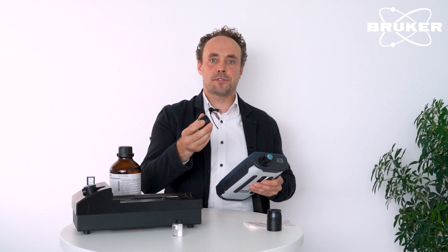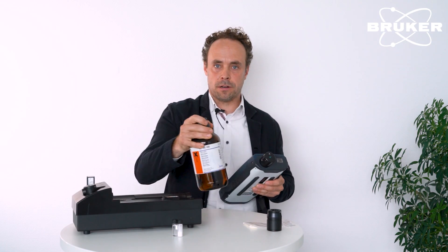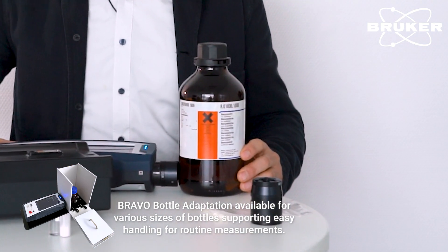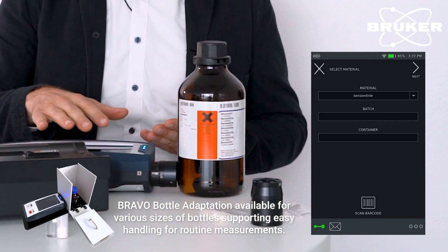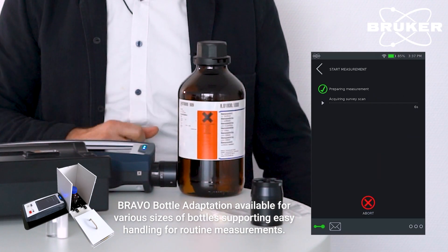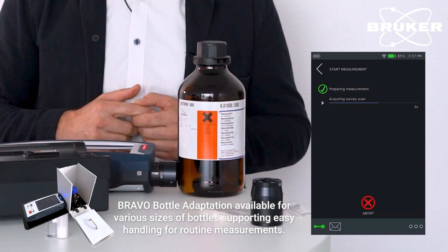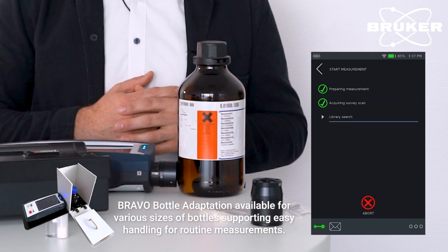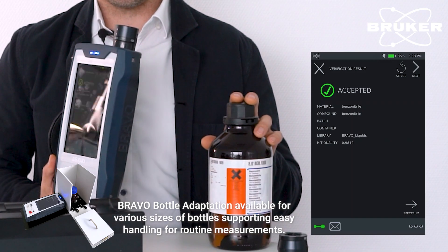This is an adaptation to measure through thicker-walled barriers — for example, through an amber-colored glass bottle. Here I have a one liter bottle of benzonitrile. I'm just aligning the instrument in front of the bottle, starting the verification workflow, specifying the material, and pressing start. The measurement parameters are set fully automated. The measurement takes a little bit longer because the amber-colored glass induces some absorption effects. And here's the result: accepted — it's benzonitrile confirmed.